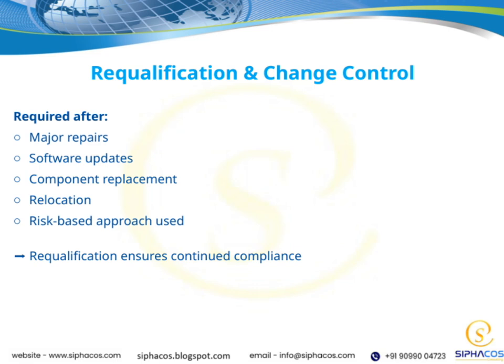This helps us prioritize efforts based on the potential impact of the change. Requalification, in this context, is critical because it ensures that despite any modifications or updates, we maintain continued compliance with safety, quality, and regulatory standards. It's all about safeguarding the integrity of our systems and, ultimately, the safety of the patients and users relying on them. So, in summary, whenever major changes happen, requalification acts as a checkpoint to confirm everything remains in order, aligning with our overall goal of maintaining high standards through controlled and well-documented processes.